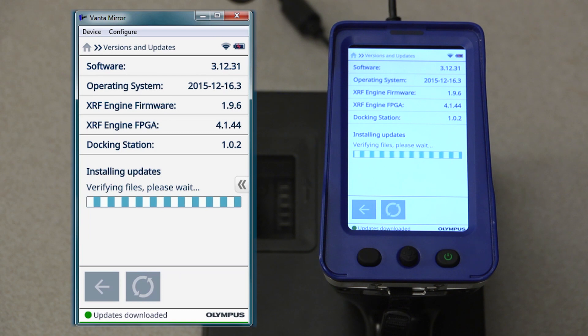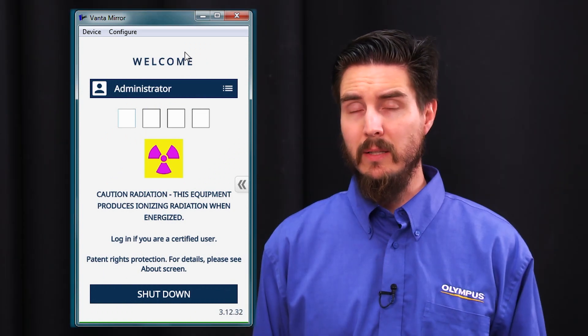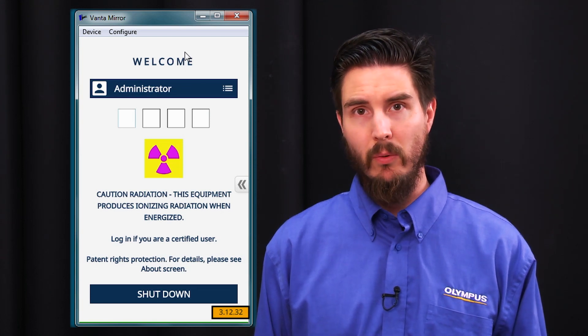After downloading, the software will self-extract and the instrument will complete a reboot in order to complete the installation. When the login screen displays again, the installation is complete. Additionally, you'll note that the new software version is reflected in the lower right-hand corner of the screen.